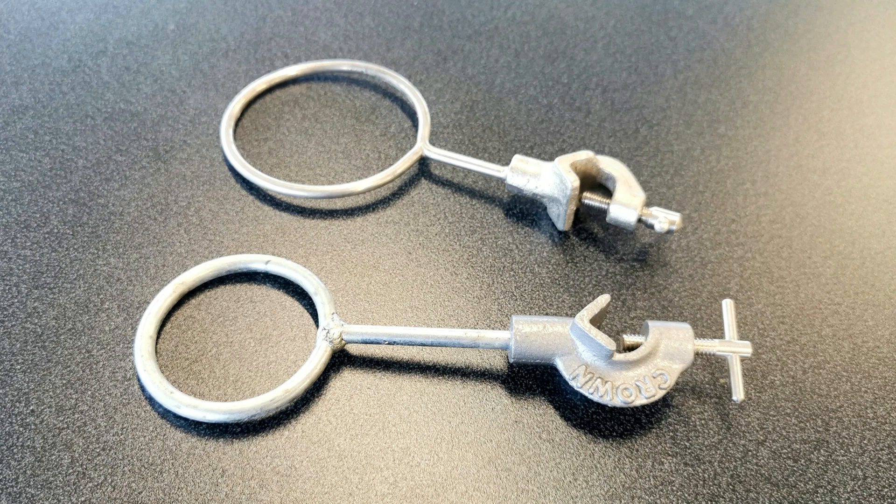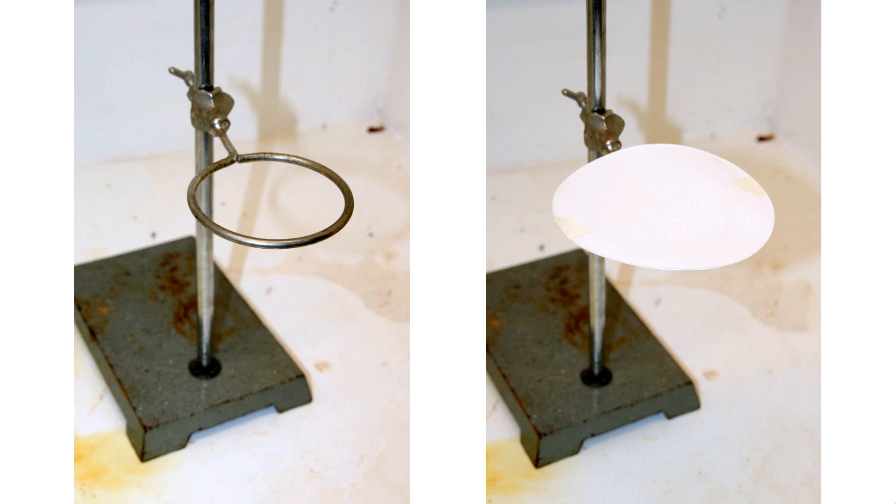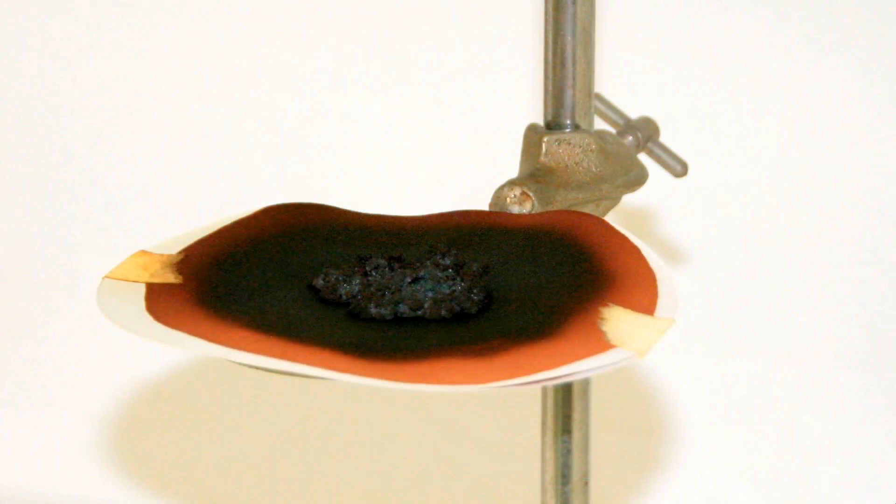Another type of clamp you can attach to your retort stand is a ring clamp. You might use it to hold a large measuring cylinder upside down — like in this photo where students trapped butane gas from a cigarette lighter to measure the molar mass of butane. Another use for a ring clamp is attaching a piece of filter paper — for example, to pour on nitrogen triiodide, leave it to dry, and then touch it with something like a meter ruler. It's commonly known as touch powder.